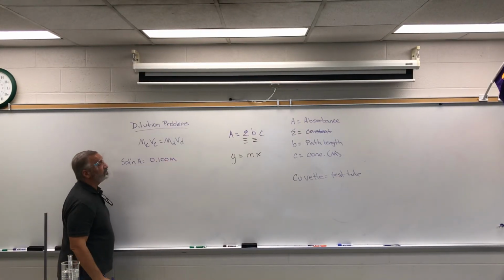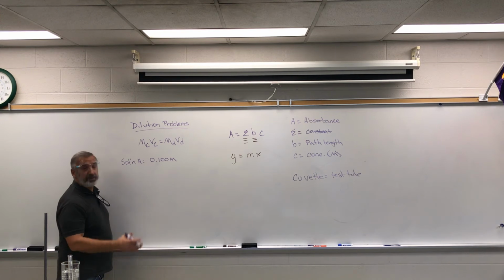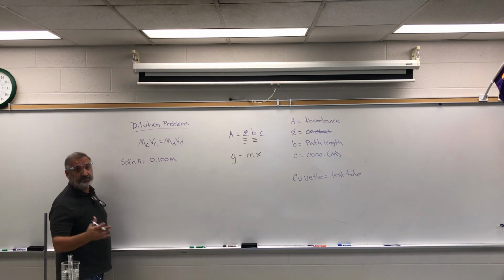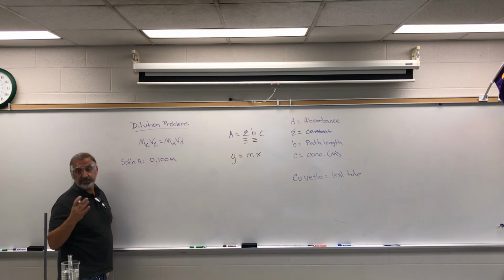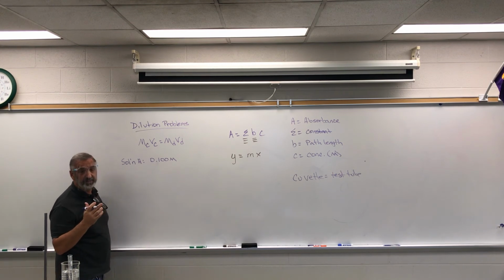Of both, we're going to do two things. We're going to do blue copper sulfate and pink cobalt sulfate, okay? So everything we're going to do twice, make two sets of solutions, and then measure. The actual measuring in the spectrophotometer goes super fast. Making these solutions, I'm hoping we're going to get done today. If not, we'll just continue on Thursday.